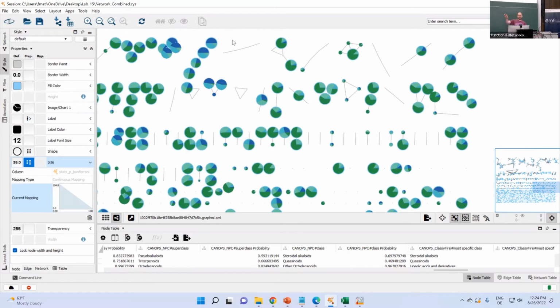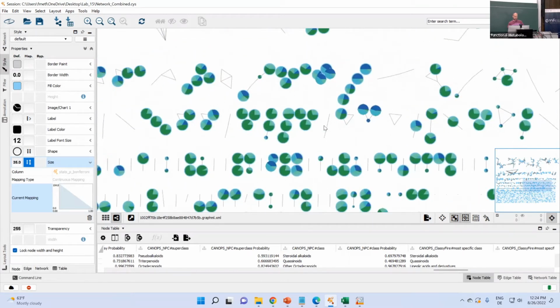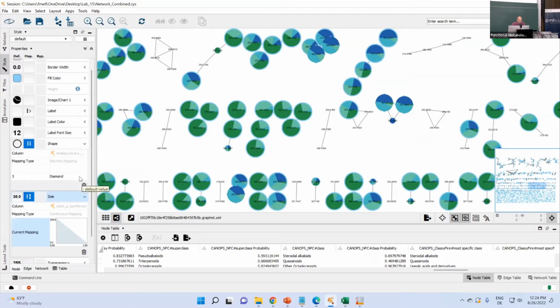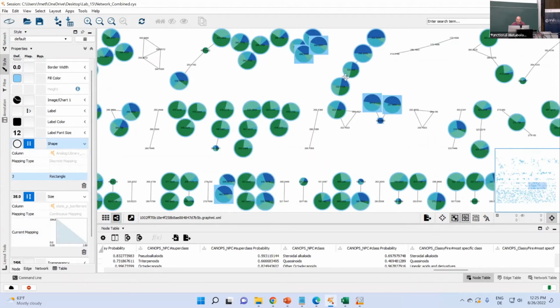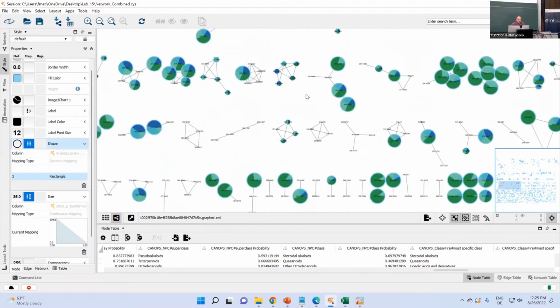So now my statistical analysis and this visualization, and my eye being good at scanning these patterns quickly, work together. Hopefully there should not be too much of a disagreement. Now with the shape, I can eventually indicate what was an analog, so now I use the rectangle, and what was a library ID compound, and that way I can explore this in the network.